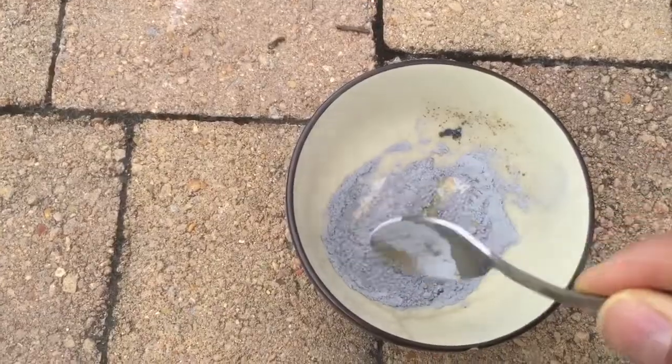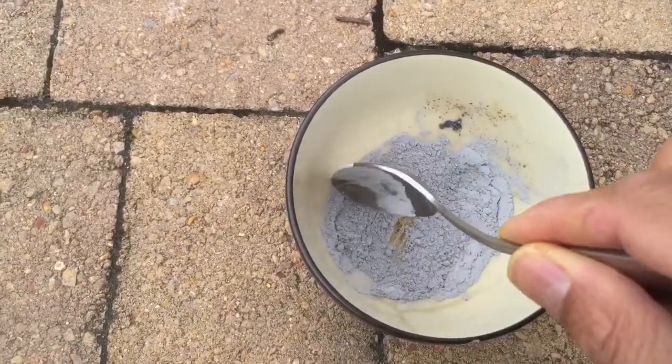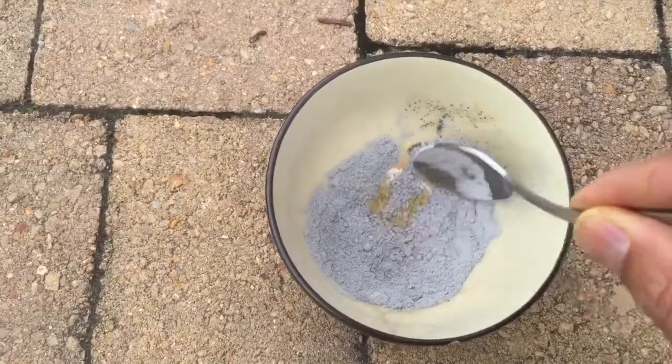By weight we're adding about five times more iodine than aluminum, but it looks like I've got excess aluminum here.